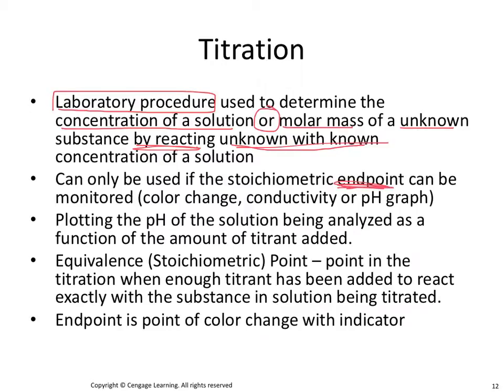Now, do you have a good way for them to remember the endpoint? Perfect. That's the hardest part about understanding the difference, because the endpoint and the equivalence point on the graph are the same, but the words mean something different. So the endpoint, use your eyes.